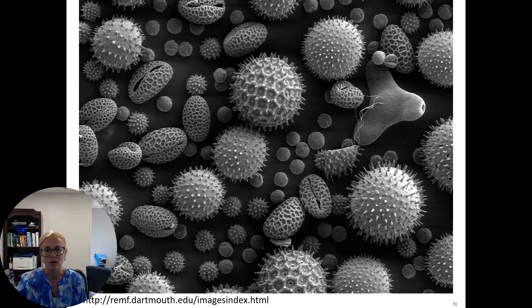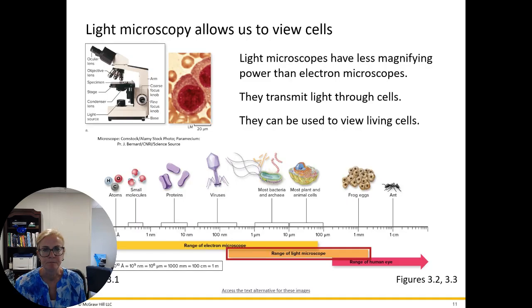These are pollen grains of various different types of plants as seen under a scanning electron microscope. So they do reveal some really interesting images. And I have to say myself, this is one of my favorite microscopes, the scanning electron microscope, because it really kind of reveals the true extent and fascinating nature of the world around us.